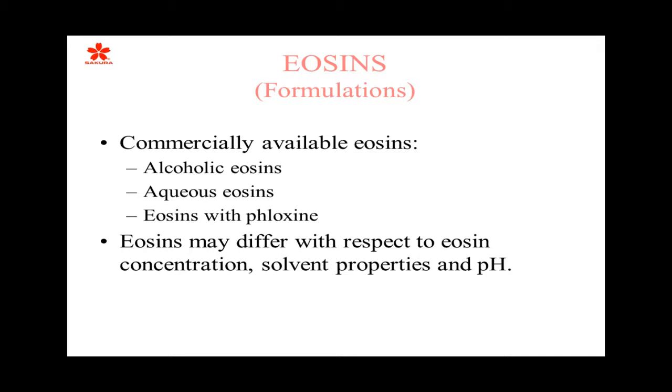Eosin in the presence of water will differentiate back out. Many of you know that once we stain in the eosin, if we rinse that too long directly in water, it's going to pull that eosin right back out of the tissues. So in procedures in the past, we would go into an alcohol before we would go into the eosin, and then we would come out of the eosin and progressively go back to our alcohols.